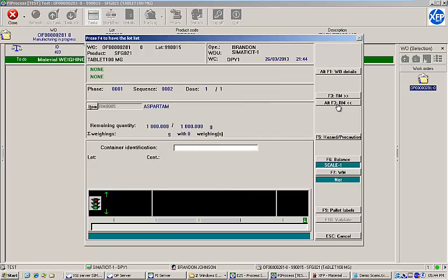At the top of the screen, some contextual data is visible, including work order number, lot number, finished good product ID, operator ID, etc.